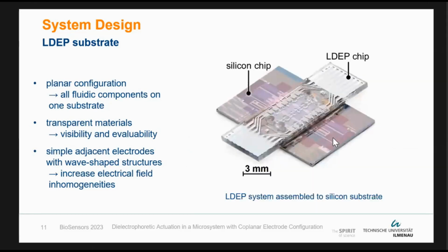So the fabricated design assembled to a silicon chip. This one is holding optical waveguide structures, but there could be anything you want on this chip. It is shown here in an assembled configuration.